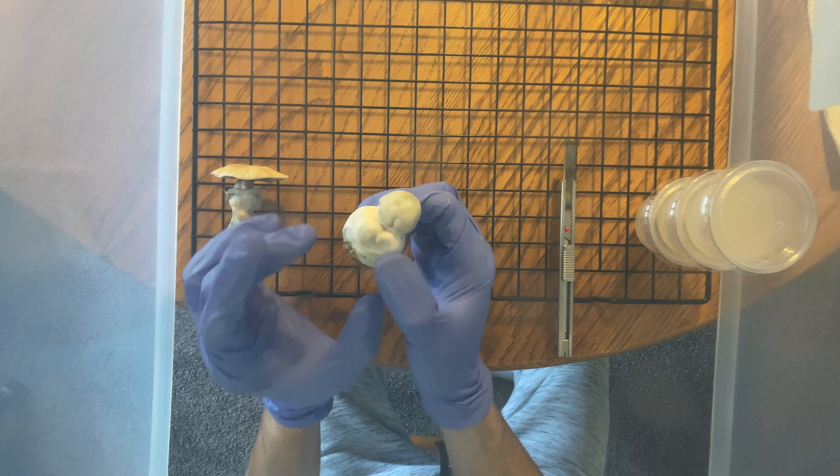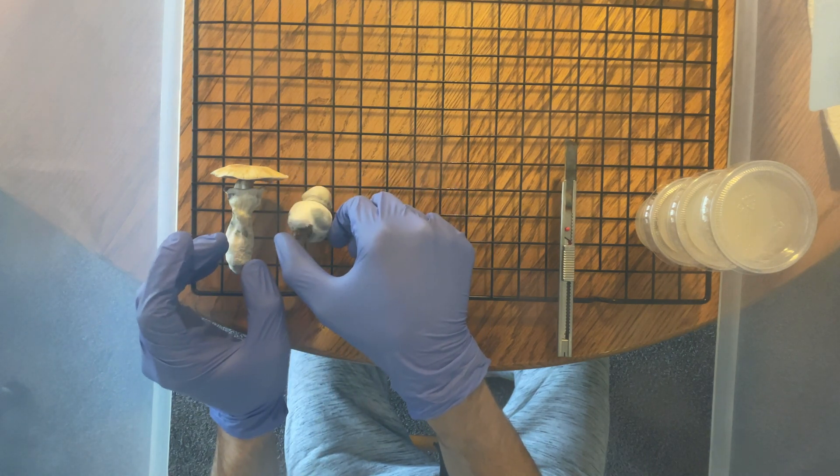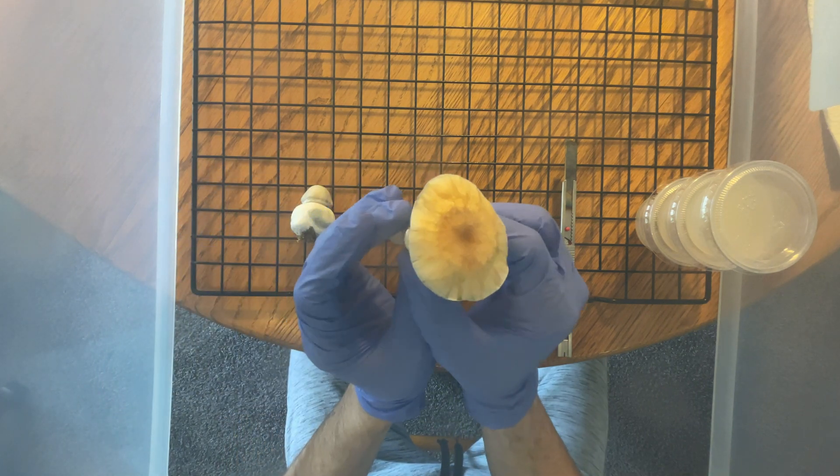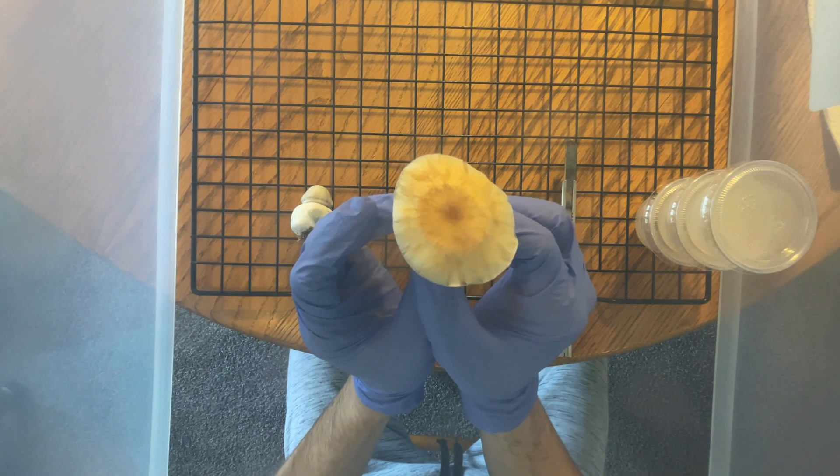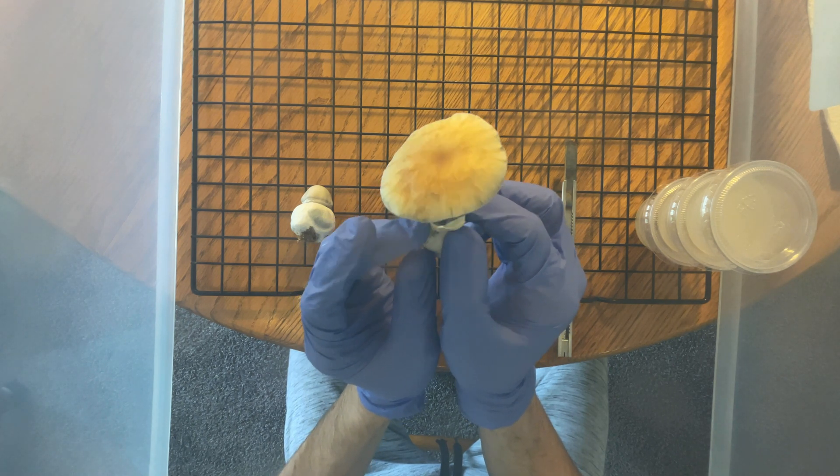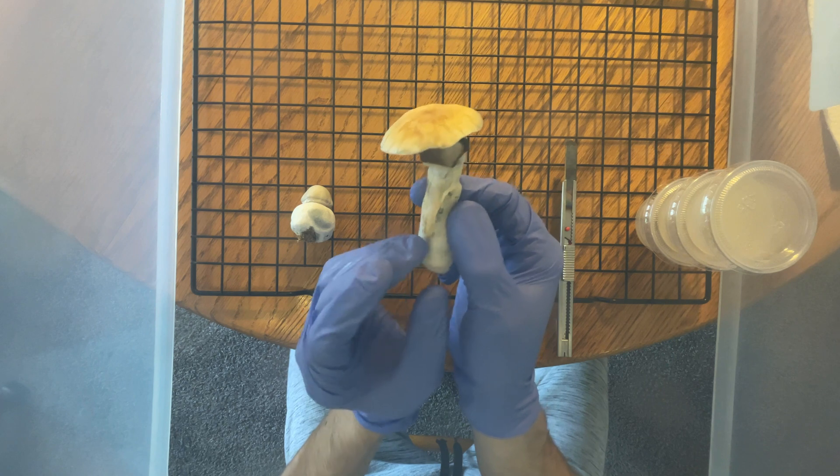In today's video, we will be cloning two different fruits, one that ended up squatting out on me and is really dense. The other fruit has some lighter pigments on the cap than the rest of the flush, so I decided to see if that's a trait that would be carried into future bins.